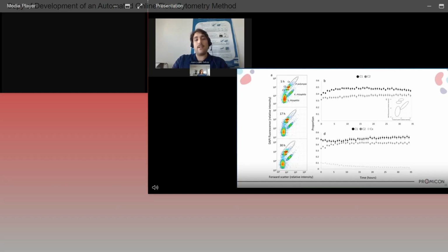An increase in the cell concentration of the subcommunities consisting of one chromosome number and two chromosome numbers, here marked as C1 and C2, as well as a decrease in the concentration of the subpopulation consisting of clusters of bacteria with 3 or more chromosome numbers, here marked as CX.